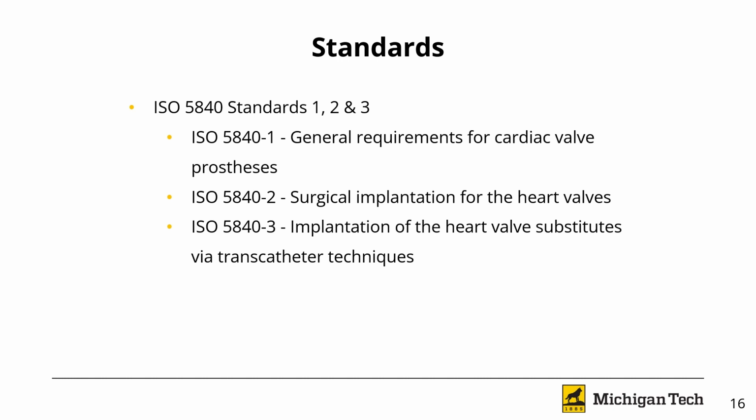These are the standards used for the design and construction of our system. ISO standard 5840 is a collection of standards used for cardiovascular prosthetics.